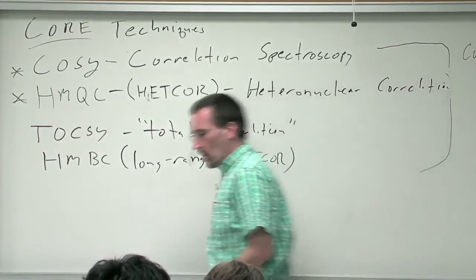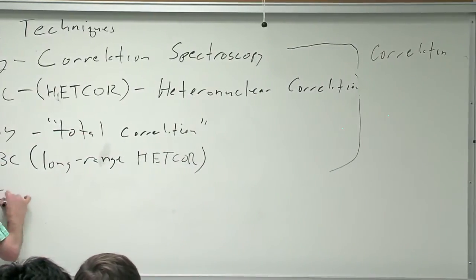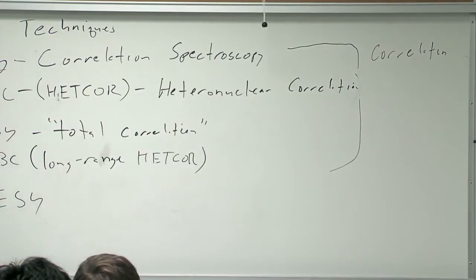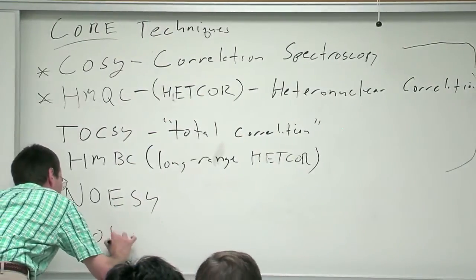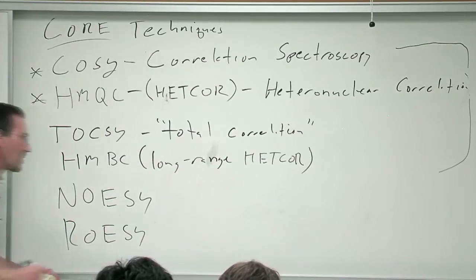And then we will also throw into the mix of core techniques NOESY and ROESY. These are both Overhauser effect experiments.